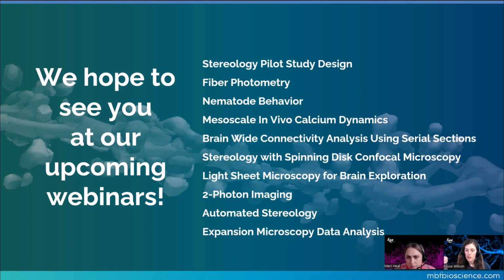And also if your images aren't aligned, so if you go to open them in as a stack and they're not aligned, we also have BrainMaker, Tissue Maker software, and that will align the sections for you, and then you can save that as a stack and bring it into Neurolucida 360's 3D window to begin your reconstruction.